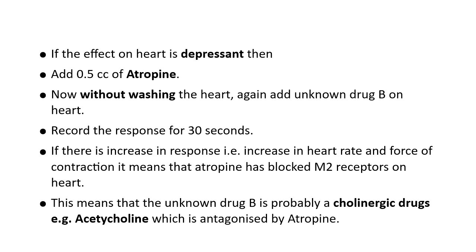If the effect on heart is depressant, then add 0.5 cc of atropine. Now without washing the heart, again add unknown drug B on heart. Record the response for 30 seconds.